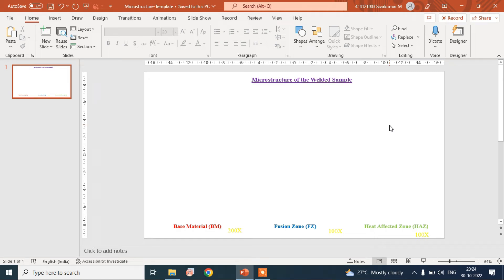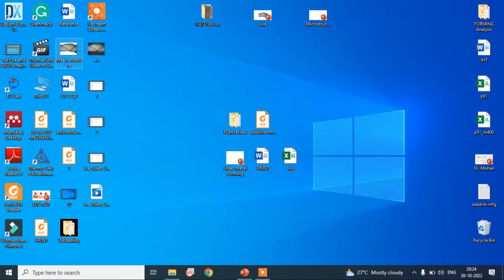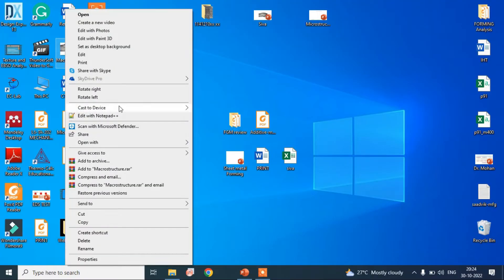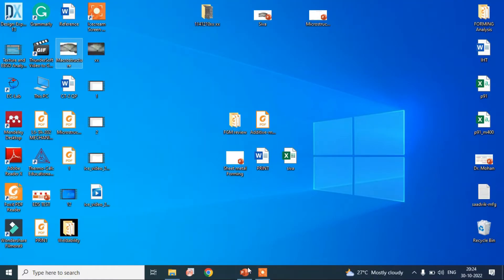In this video, I am going to explain the reading of microstructure for the welded sample. We have already completed the macrostructure of the welded sample — just copy and paste it into the PowerPoint presentation.